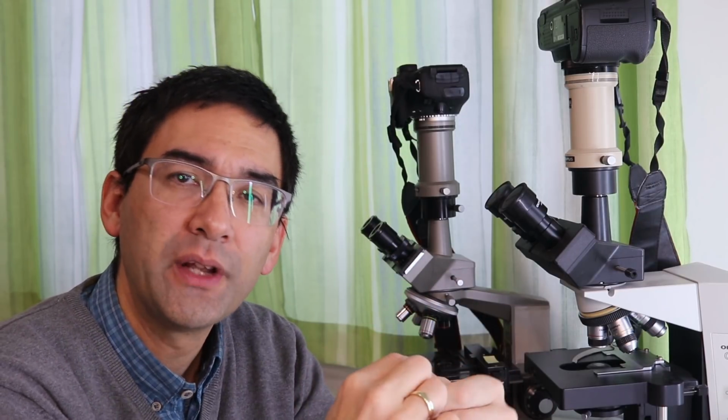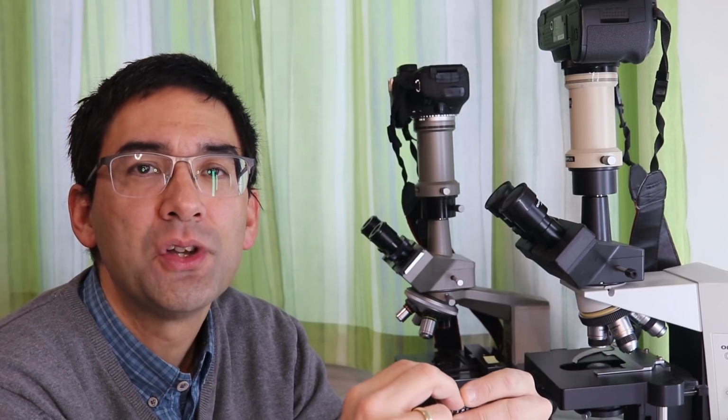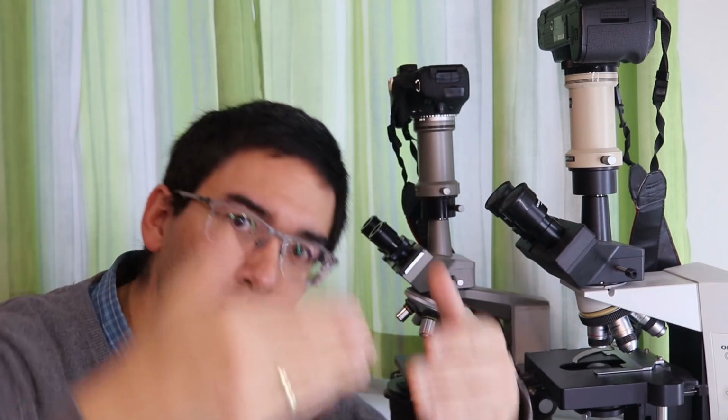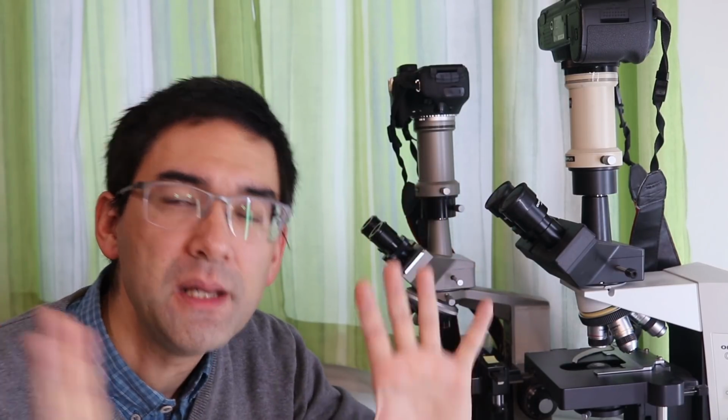However, even if that were the case, if I had the money, I would still buy wide field eyepieces, because the parts that you want to look at, you're going to move into the center anyway, so it doesn't really matter if it's a little bit blurry on the side. Okay, I'm just saying this. Even this disadvantage of being blurry is not a very big disadvantage in my view.